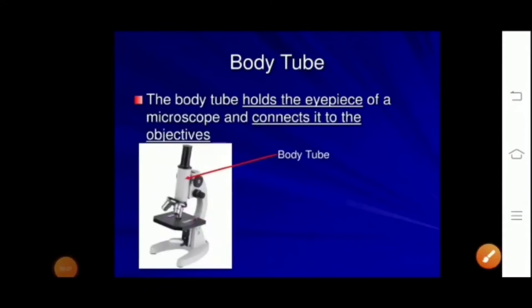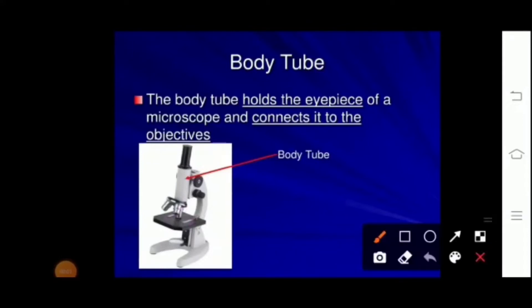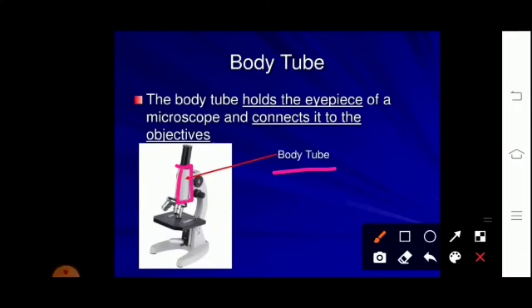Coming to the next part of the microscope: this is the body tube, or tube of the microscope, which is cylindrical in shape. The body tube holds the eyepiece of the microscope and connects it to the objective.